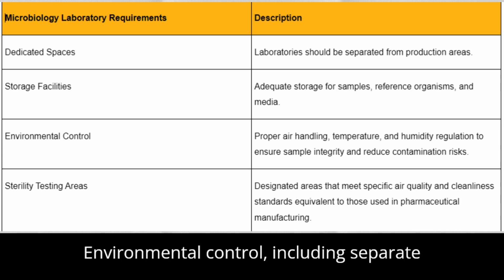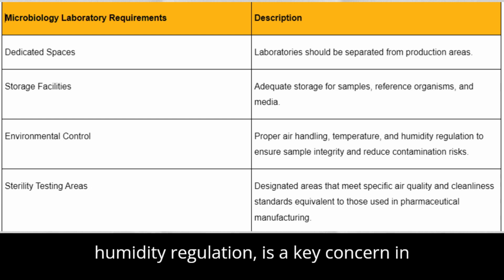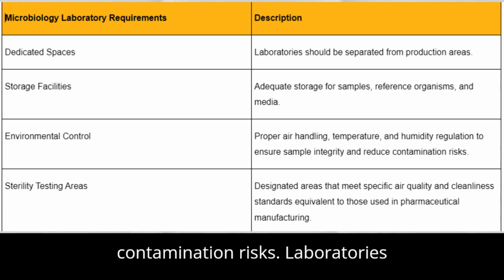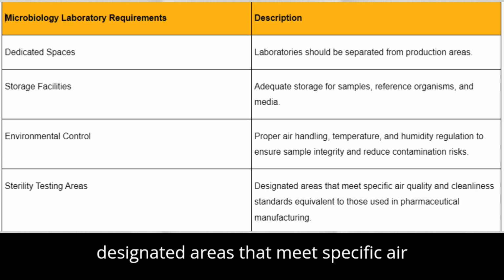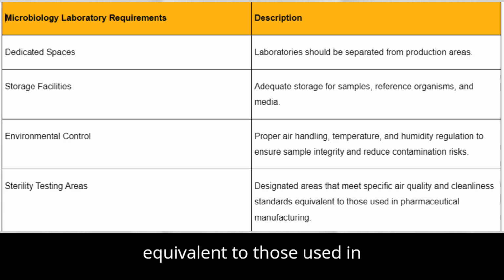Environmental control, including separate air handling and proper temperature and humidity regulation, is a key concern in ensuring sample integrity and reducing contamination risks. Laboratories conducting sterility testing should have designated areas that meet specific air quality and cleanliness standards equivalent to those used in pharmaceutical manufacturing.